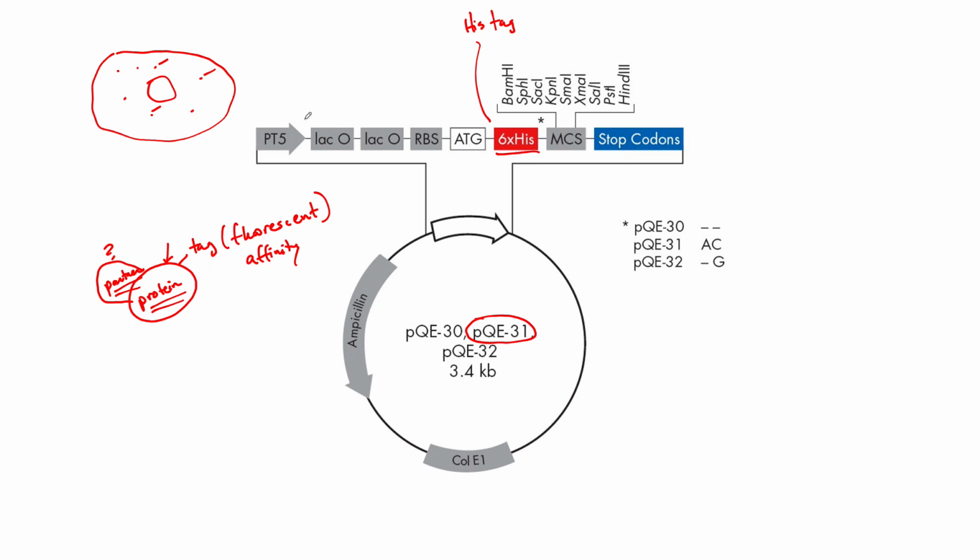Well, these affinity tags are typically amino acids or small molecular moieties, which is basically a structure that you can attach to these proteins, and these tags act kind of like Velcro on the protein.